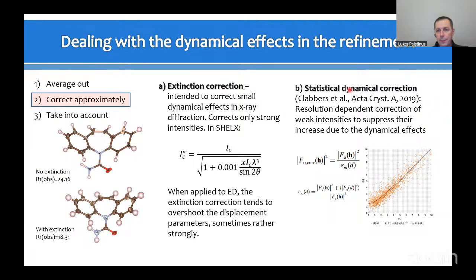There is also a publication on another statistical dynamical correction. I haven't seen it in action very often though. As far as I understand, it's not available in any standard or commonly used structure refinement program.